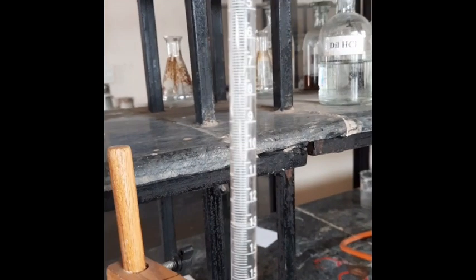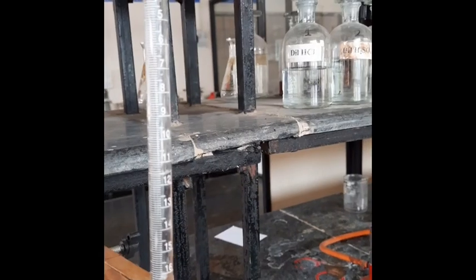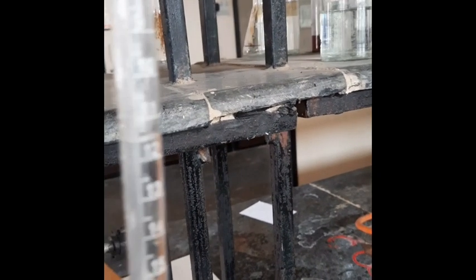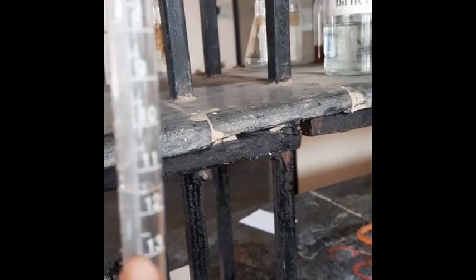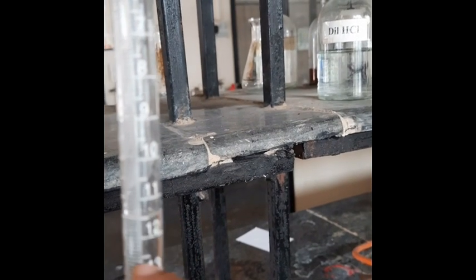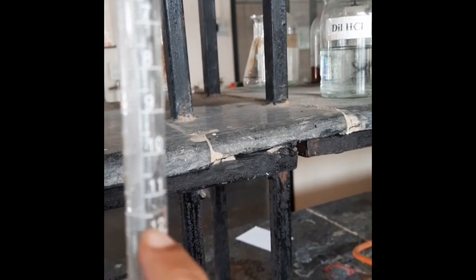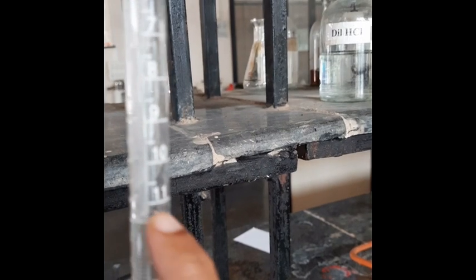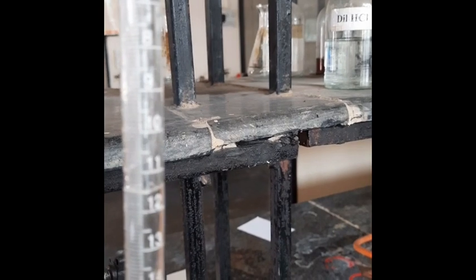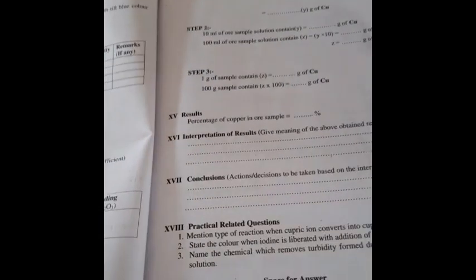Okay, now observe your burette reading. Now see the reading, observe the reading properly. Here it is 12 and here it is 11. So it is in between 12 and 11. Okay, so your reading is 11.5. You have to record this reading in our manual observation table.